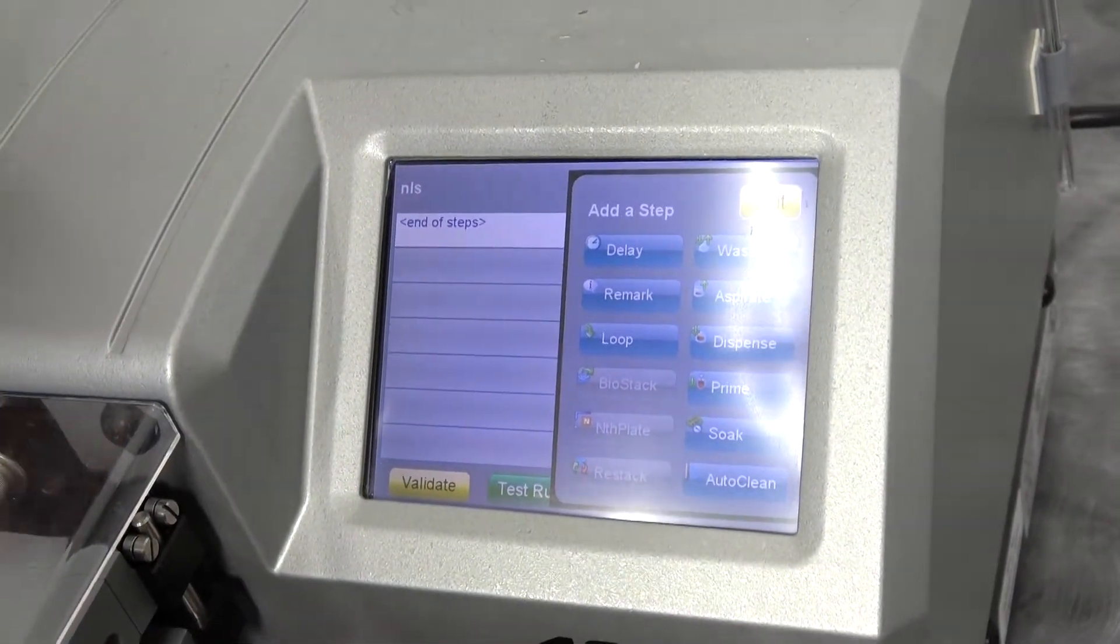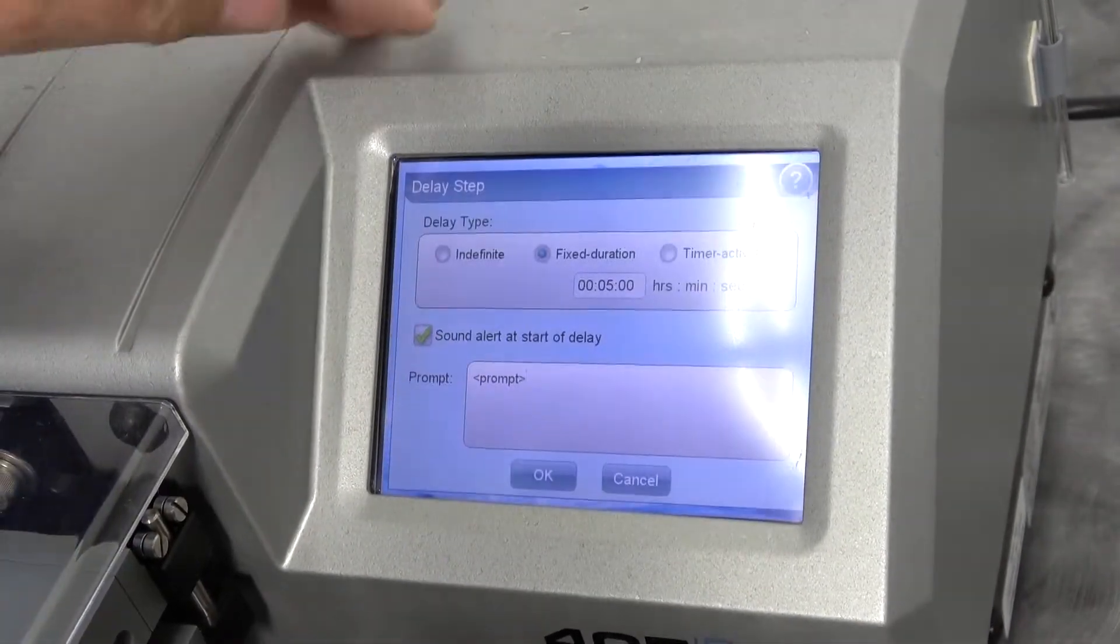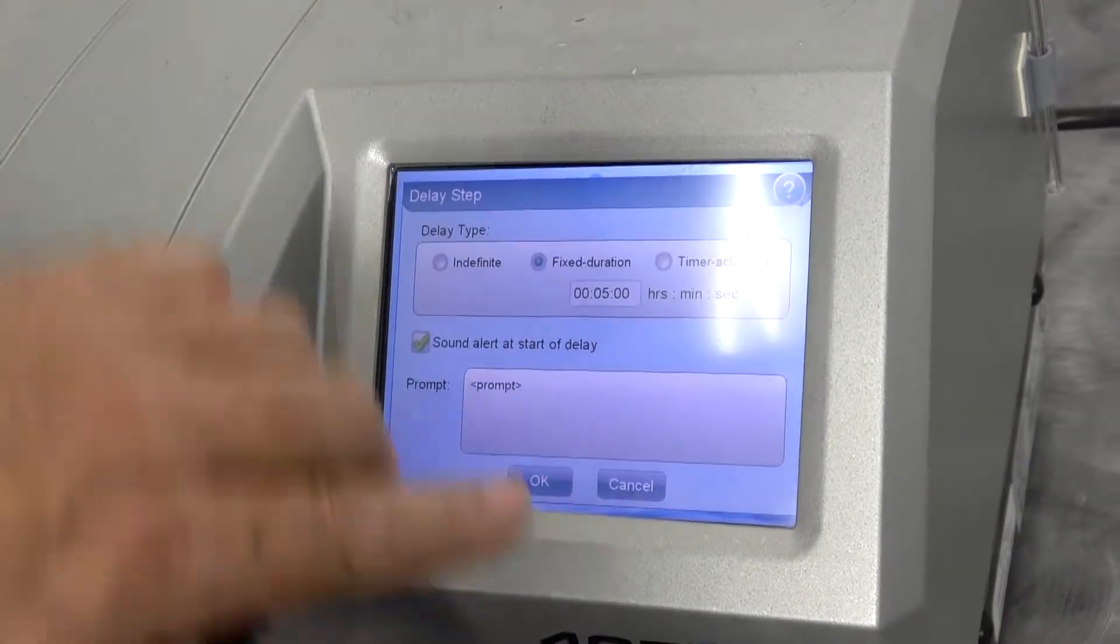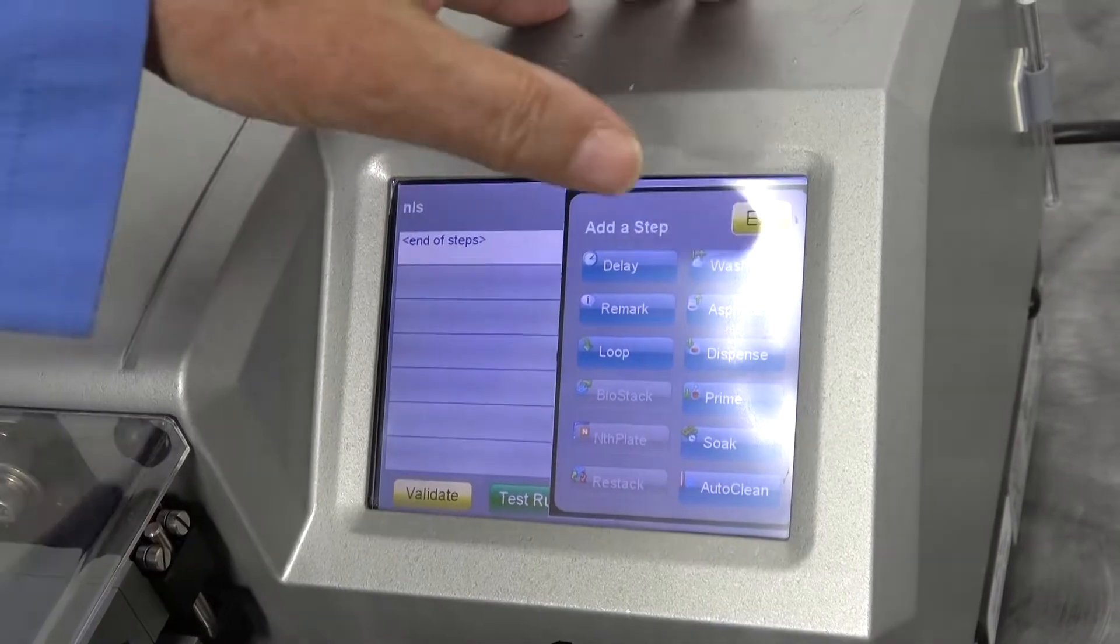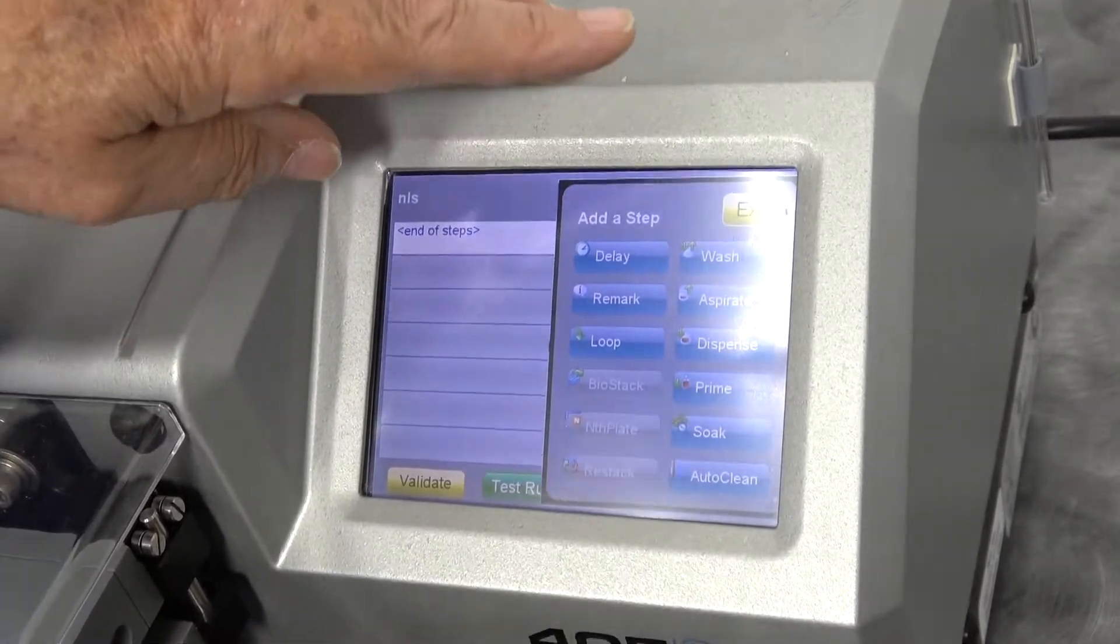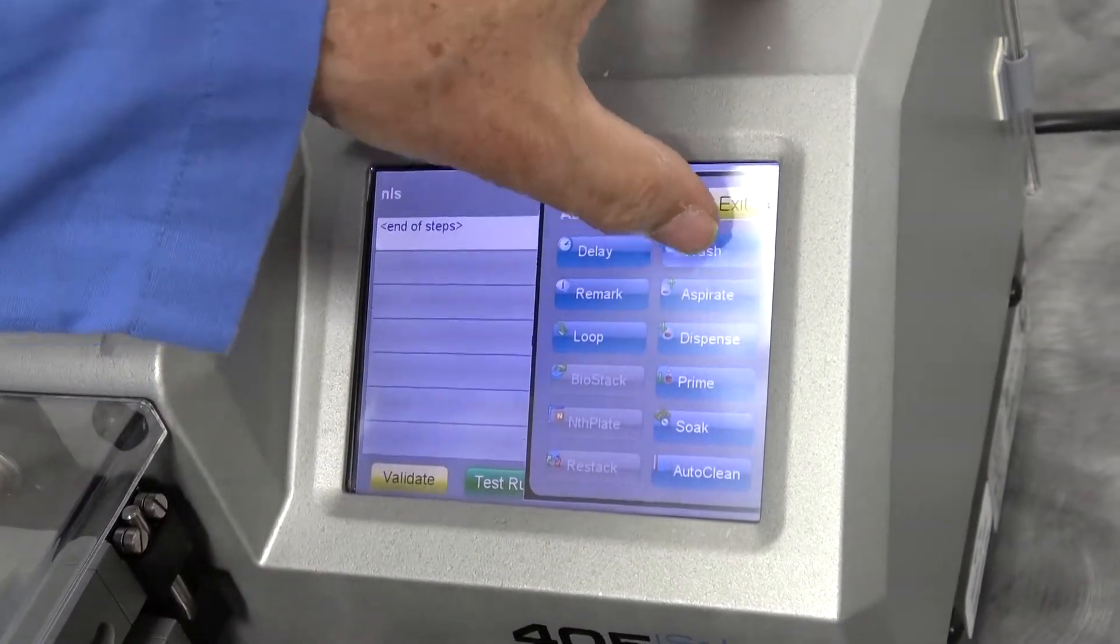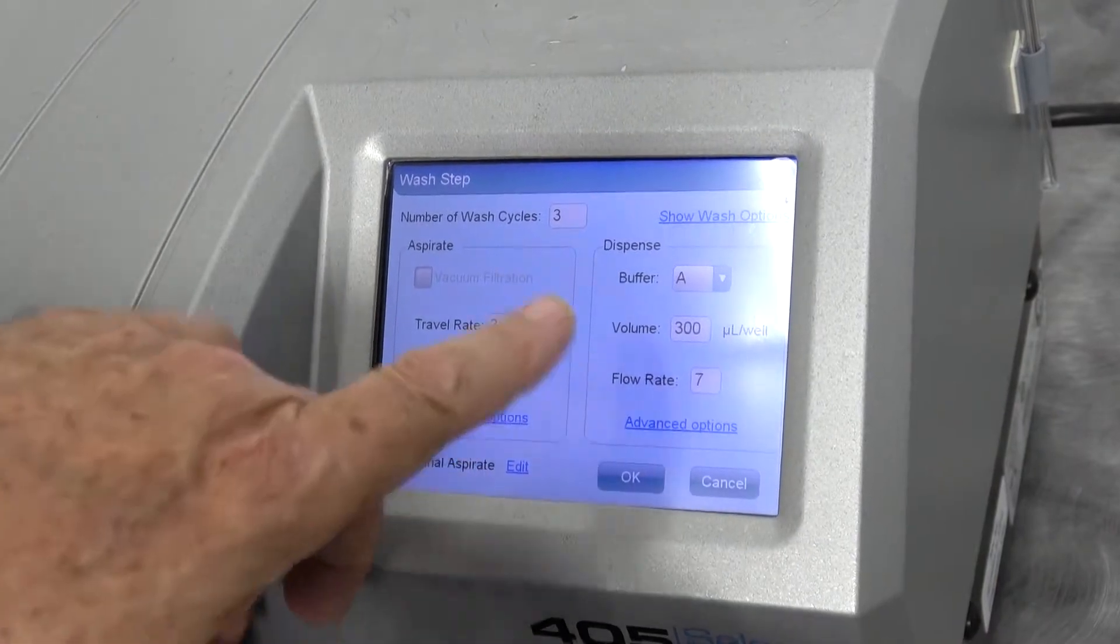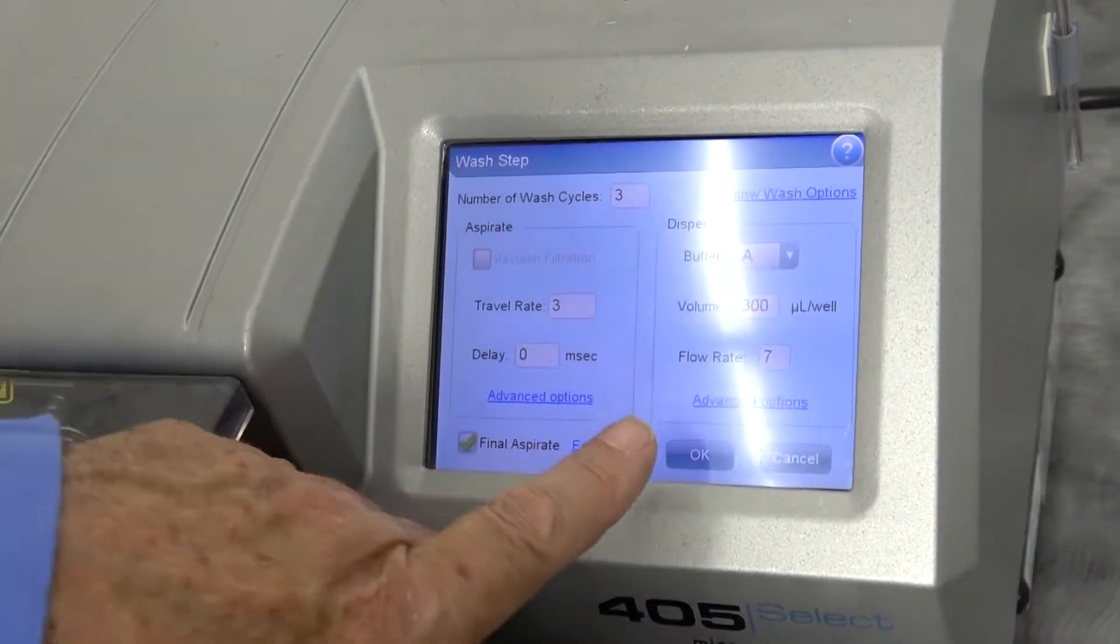We can put a delay, so you can give instructions of what somebody should be doing—a prompt, in other words. Add remarks. You can have it go through a loop. Of course, wash, aspirate, dispense, prime, soak, and auto clean, which is for your sonification, and it is so easy to program. You press wash. You tell it how many cycles you want to aspirate at the beginning.